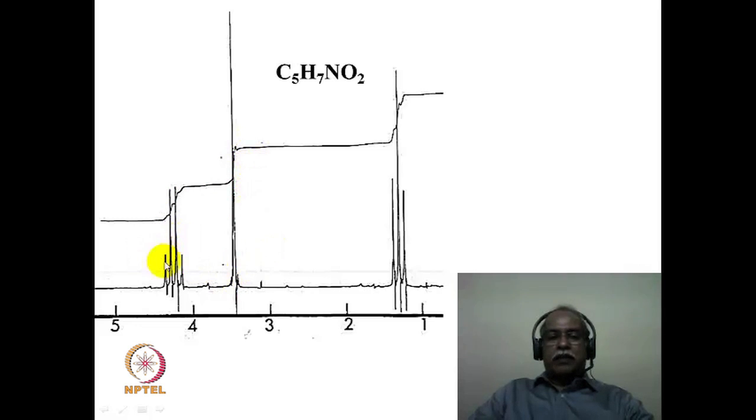This is because of a CH2 hydrogen. Because it is a quartet, this is also most likely a CH2 type of functional group. See that the CH2, the multiplet quartet, comes above 4 ppm. So once again it is most likely an ester functional group. So it is an ethyl ester. What we have identified as structural features is COOC2H5 and a CH2 group.